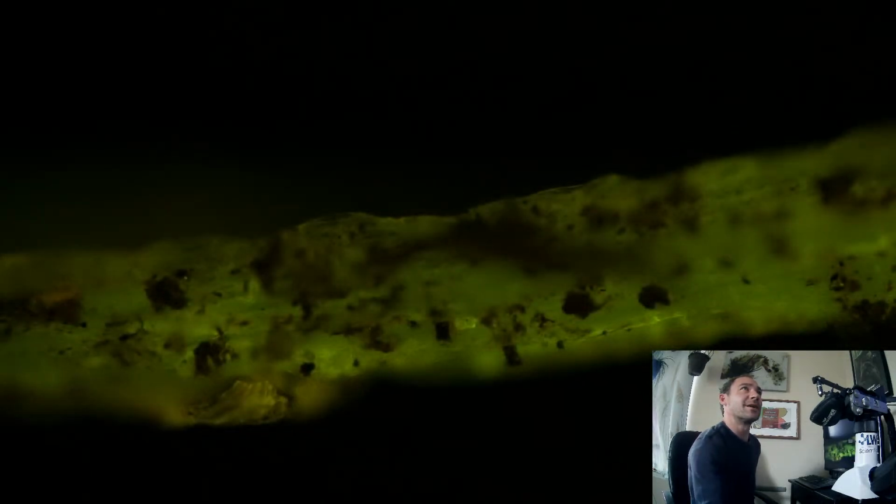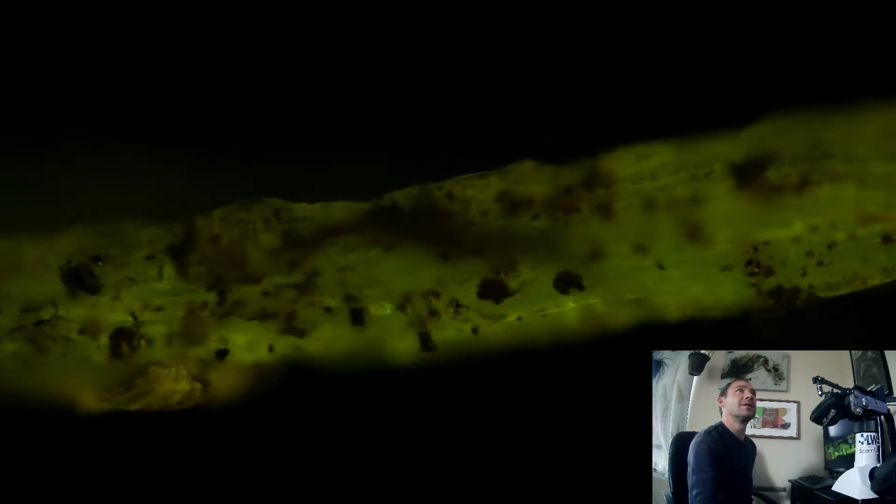But yeah. Let's see, do we have any more questions? Yeah, let's go back out to 2x here. So now 2x digital zoom. Just kind of scrolling back across, getting a good look at the whole rest of the thing.